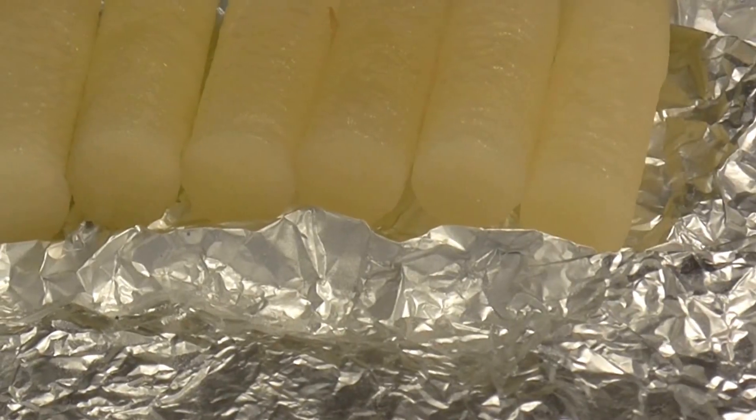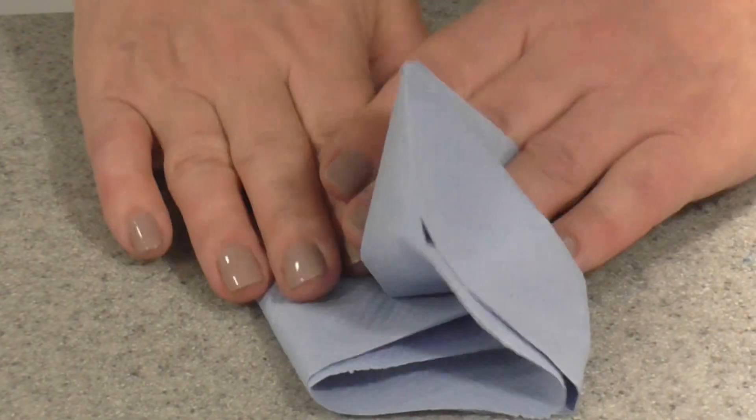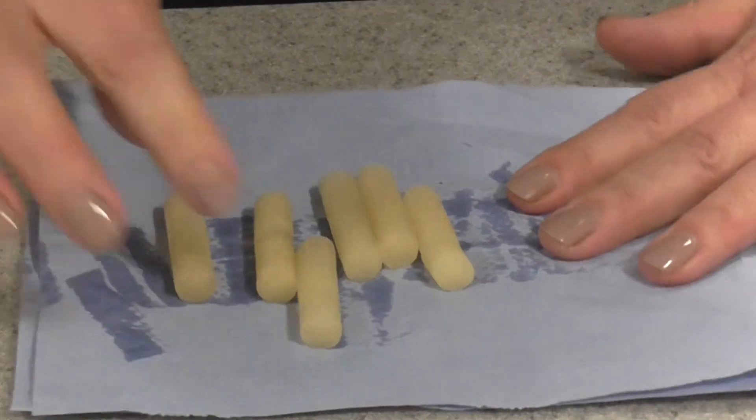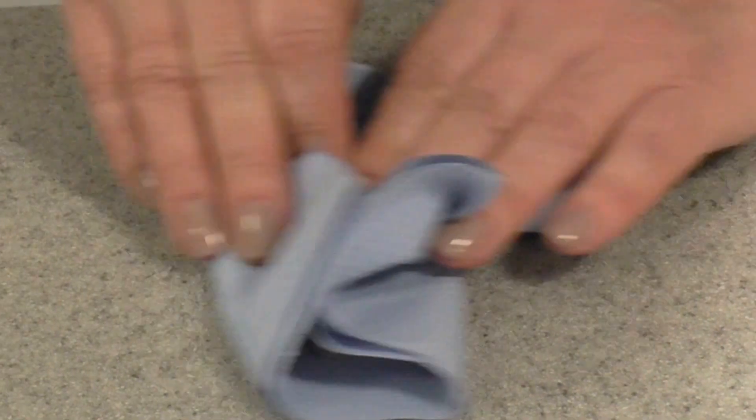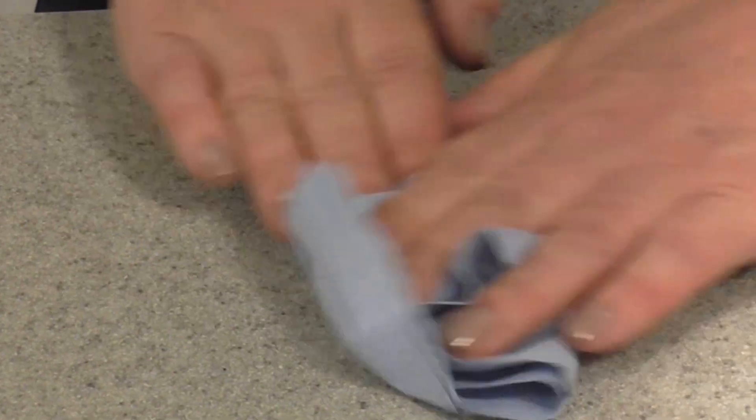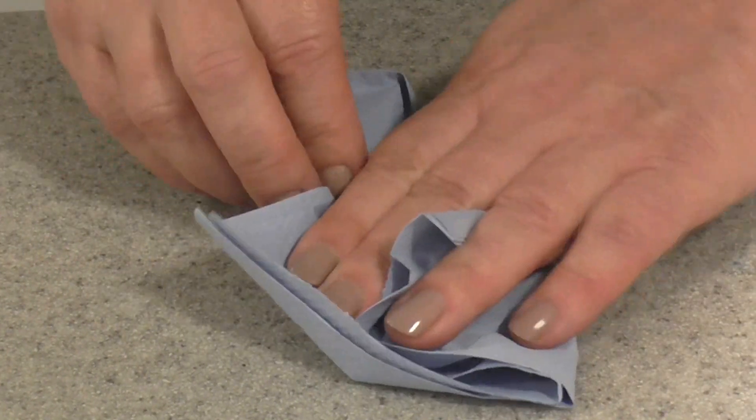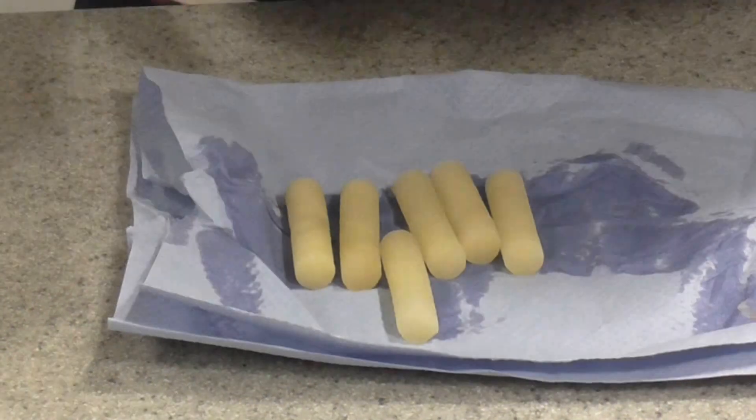Now the next thing we're going to do, once we've prepared our little chips, all very similar in size, we need to make sure they are thoroughly blotted dry. Just make sure you've got no potato skin left on the ends of them. Let's blot those to get rid of any excess water, any extra moisture.